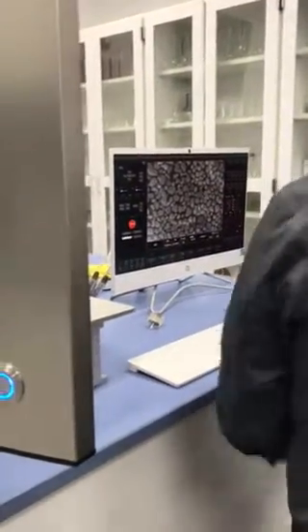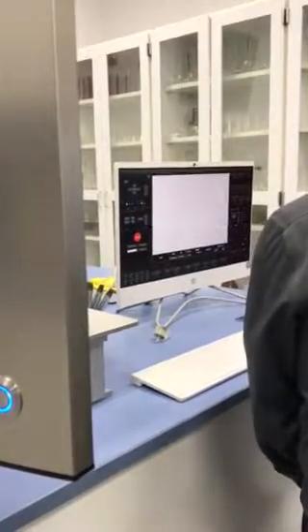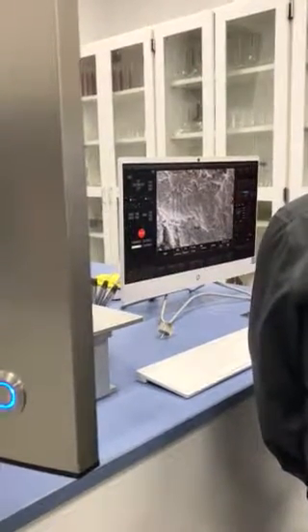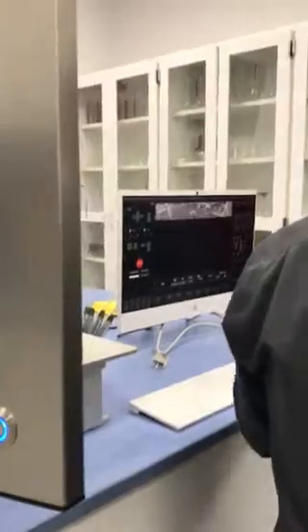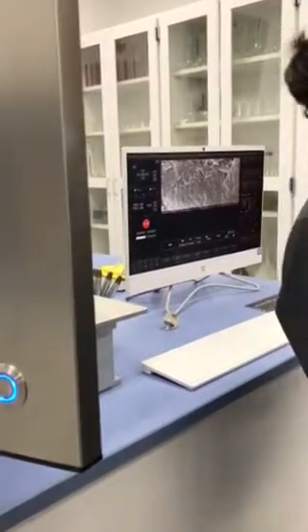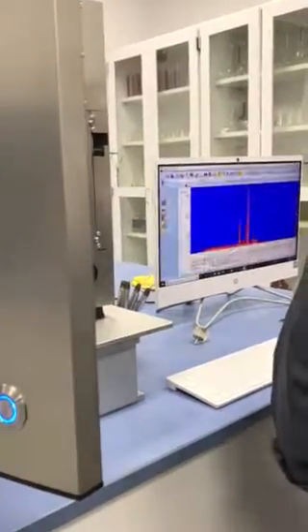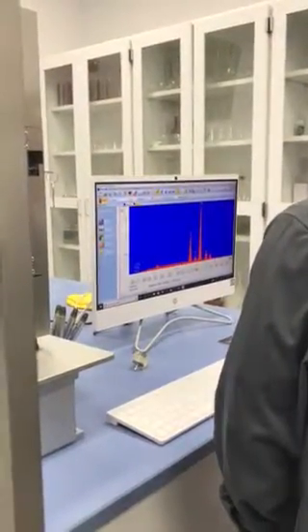With the smallest spot size I can have. The spot size control — spot size 1 is where I am right now, Dan. If I go to spot size 15, look how much signal I gain — it gets a ton brighter. At base mag it would look very washed out, a very bright image. But we can operate with the lens closed because we're picking up that much signal. So why do we have beam diameter control at all? When we do x-ray analysis — and that's where Dave would come in, and Dan does x-ray analysis — you say, what's this area made out of? We'll have an EDS system and we'll acquire a spectrum and say, hey, we're looking at iron, chrome, manganese, nickel.